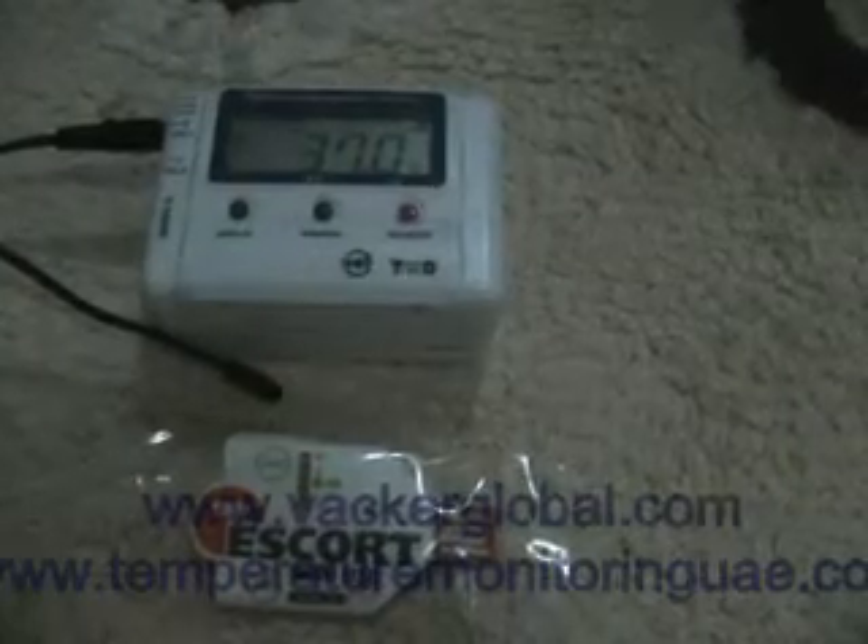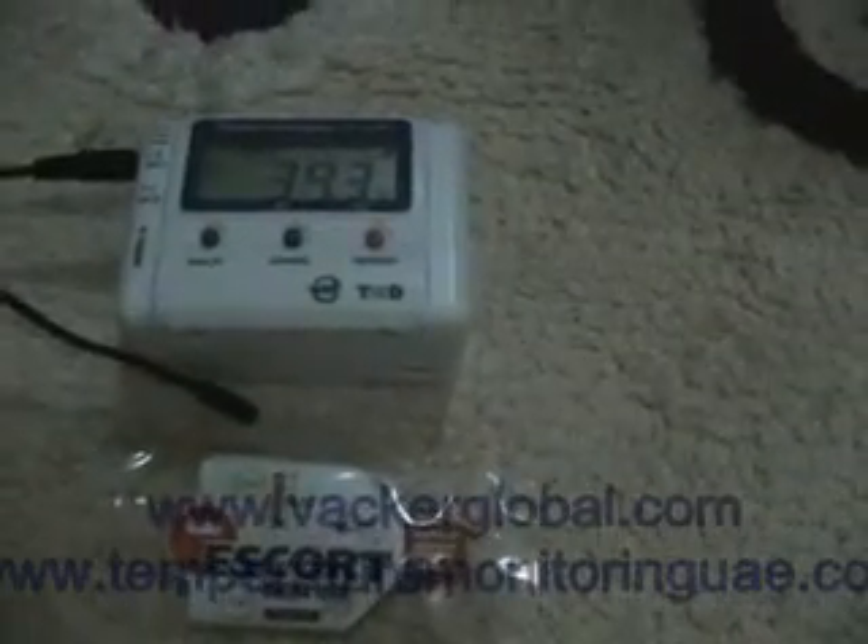We are applying high temperature using hot air. You can see that the temperature is rising. The temperature has crossed 30 degrees for 60 seconds and the LED shown as H has started blinking.